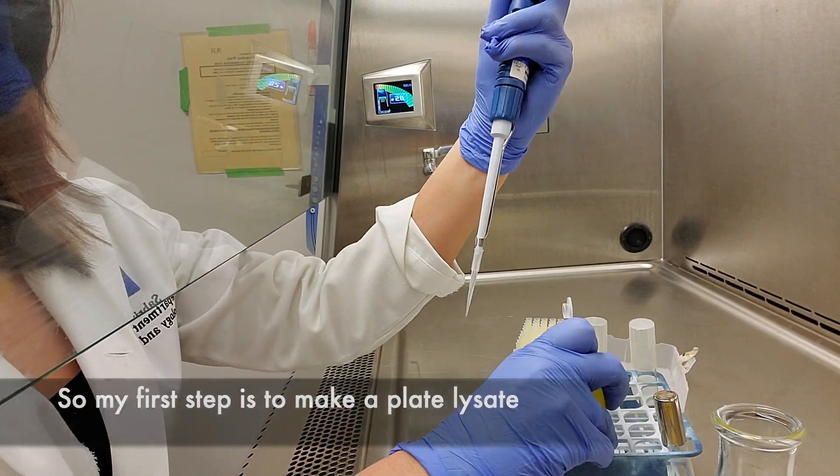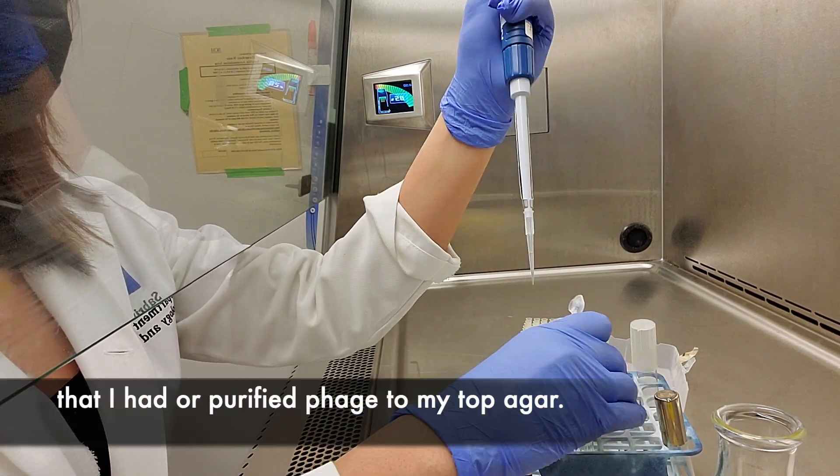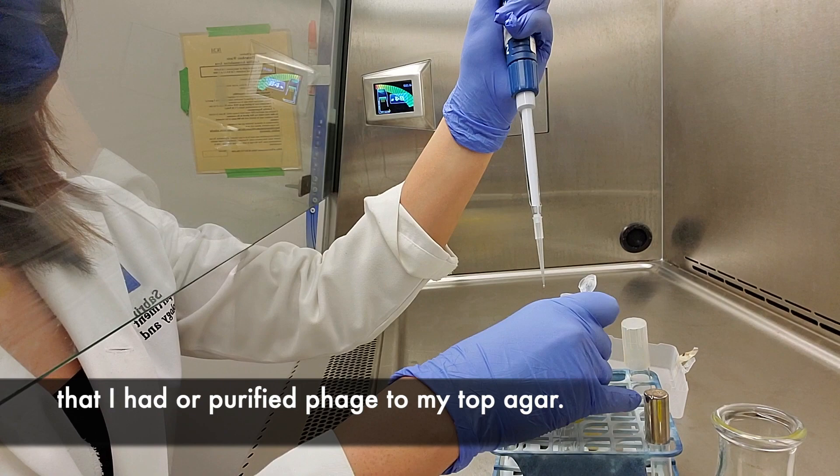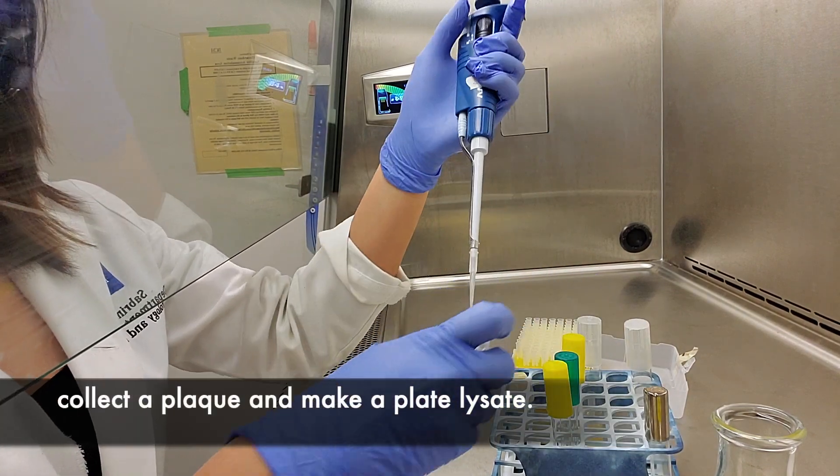My first step is to make a plate lysate. I add some already-made phage lysate, or purified phage, to my top agar. In a previous video I showed you how to collect a plaque and make a plate lysate.